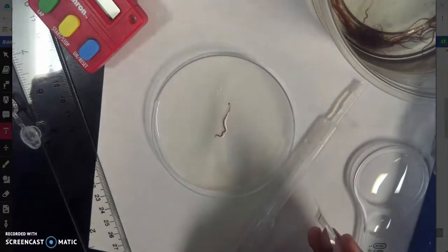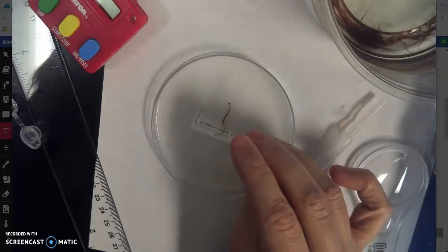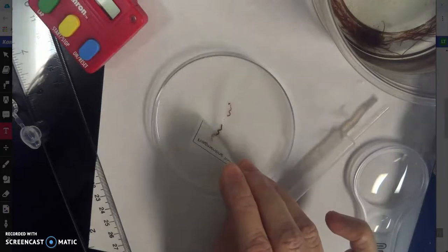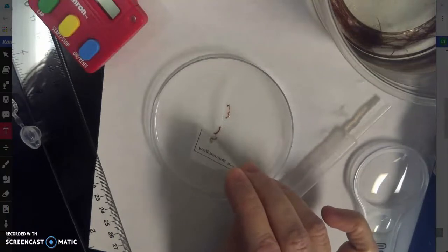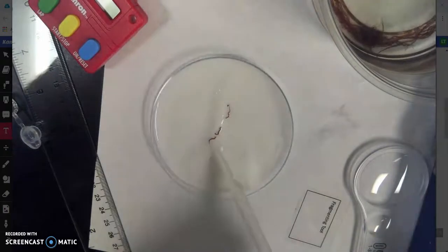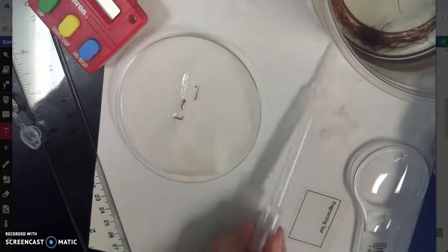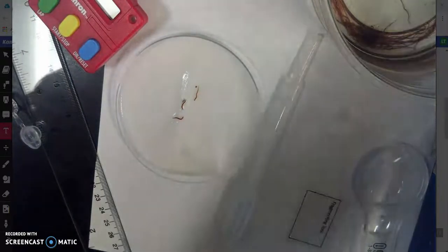Okay, and I'm going to take this blackworm and turn it into 3 blackworms. So I'm going to fragment it here. See, there we have now 2. And I'm going to fragment it here. Okay, there we go. Now we have 3 separate worms, and all the pieces are still alive. None of the pieces are dead. They're all still alive.